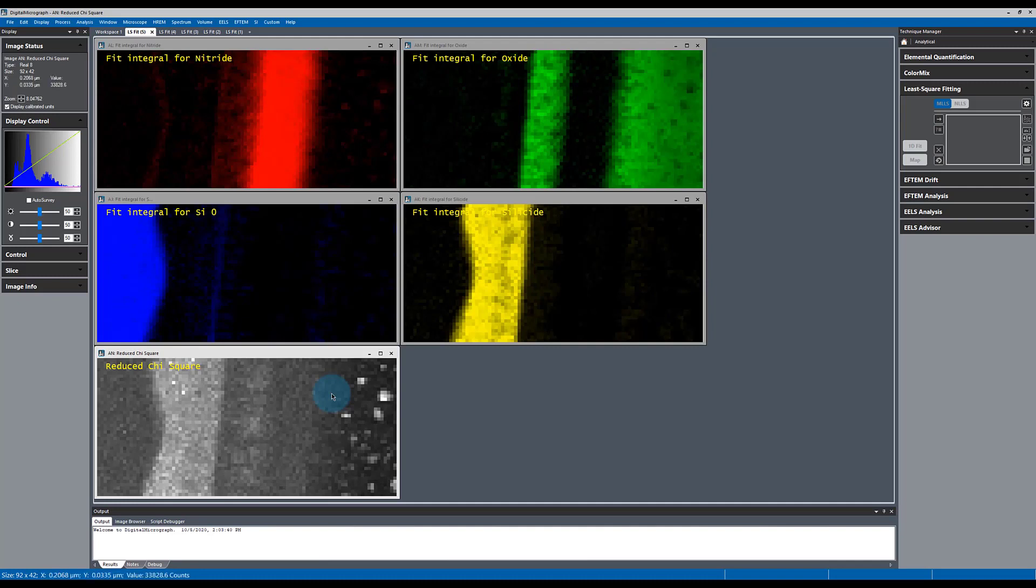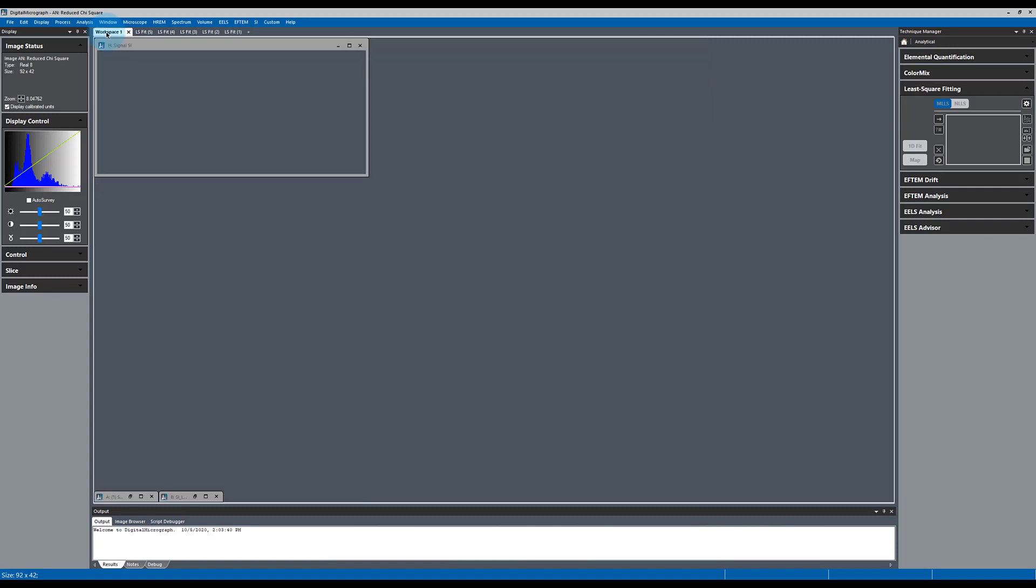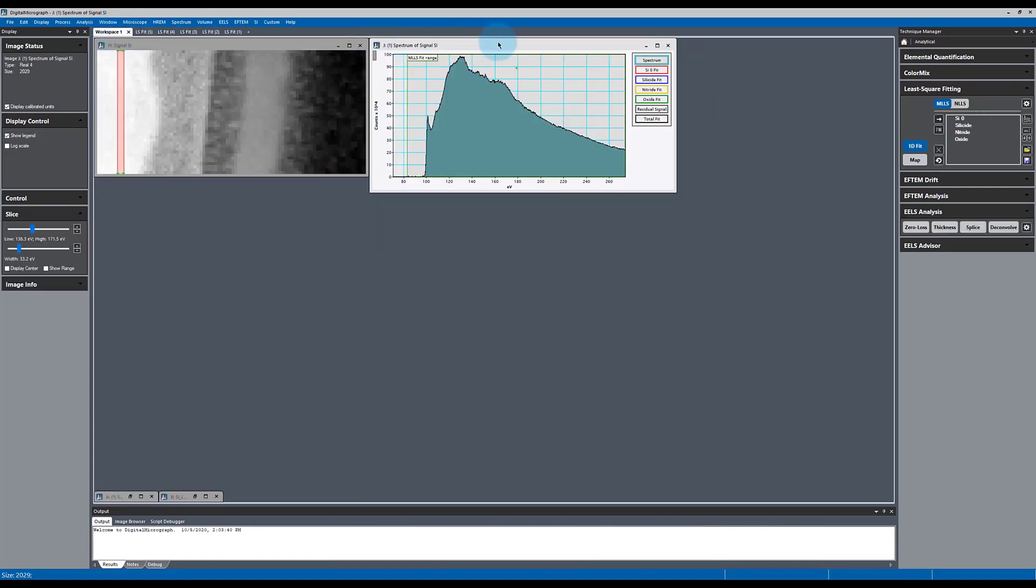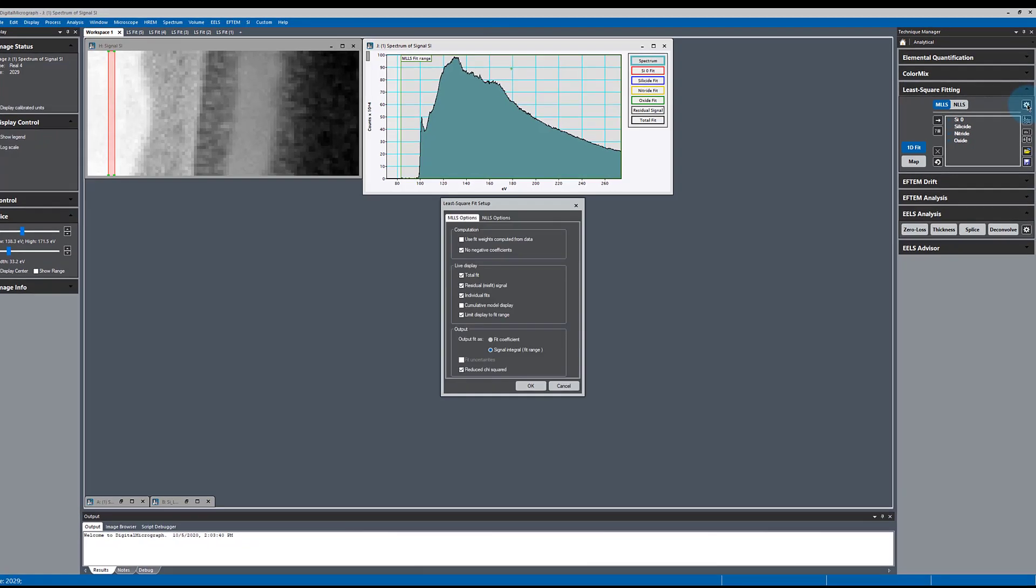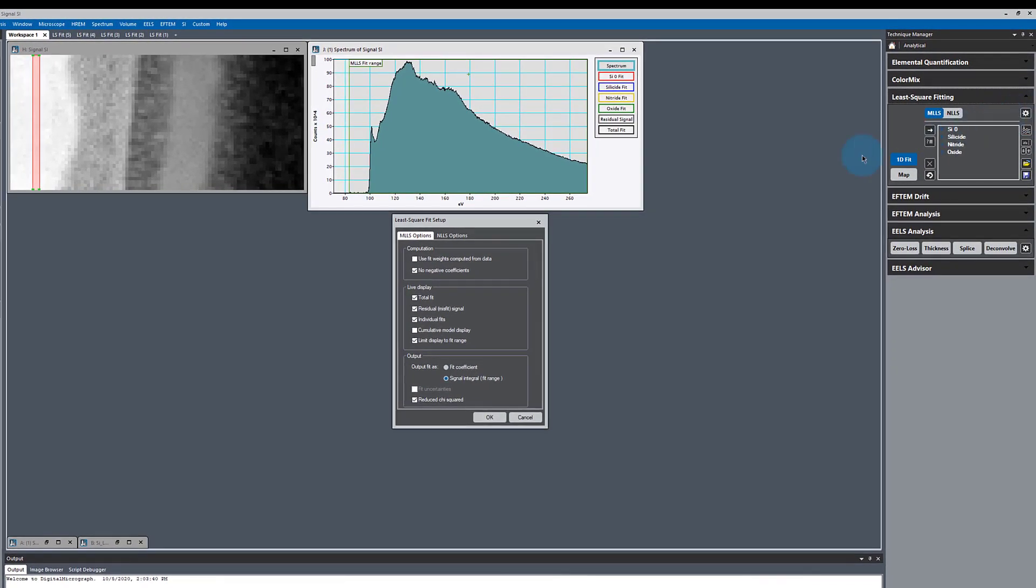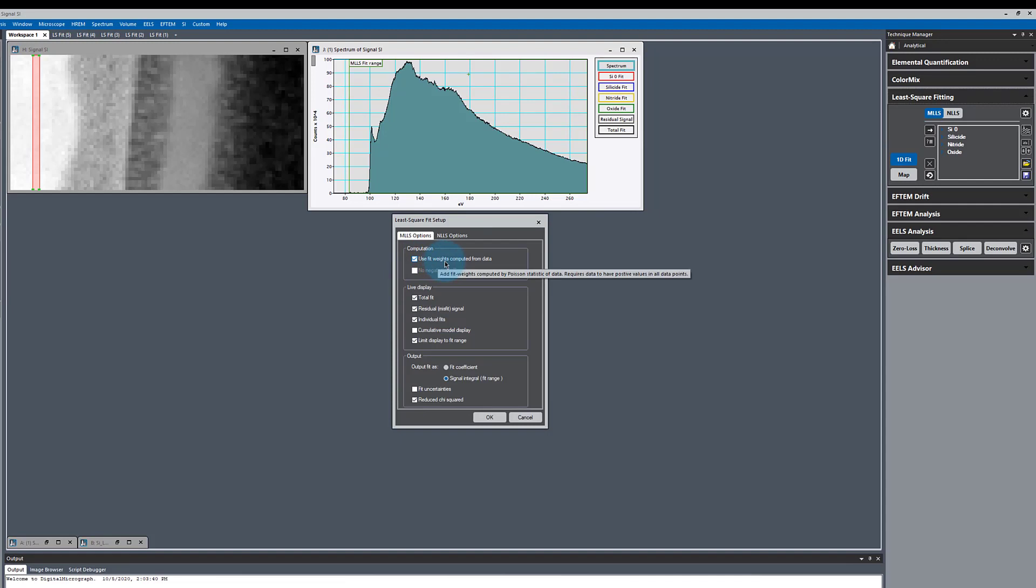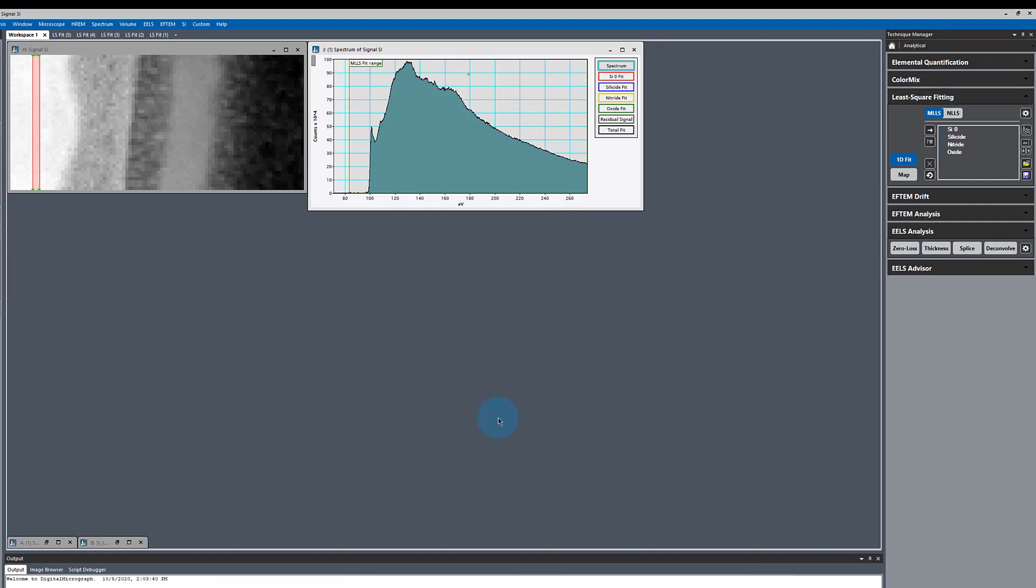There's one other option I just want to show you. We go back to our data and go over to the settings. We had non-negativity selected. I'm going to choose use fit weights computed from data. This should give us better statistics. However, there's one problem with this.